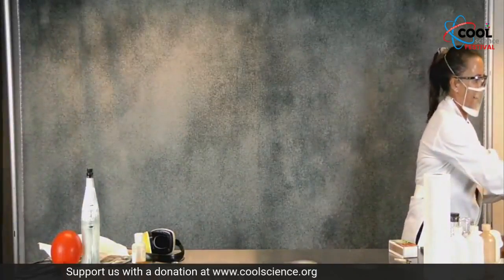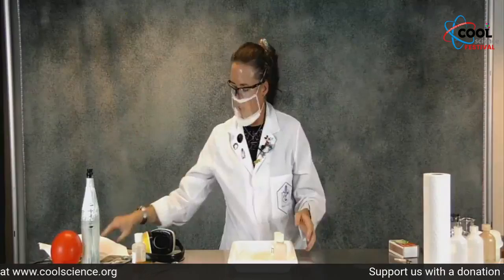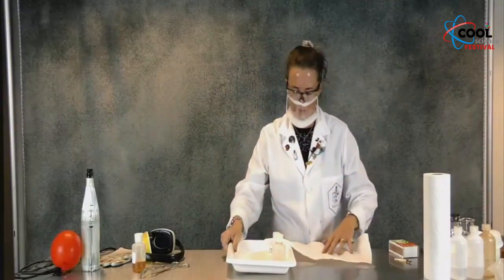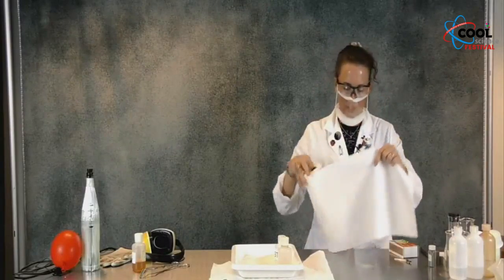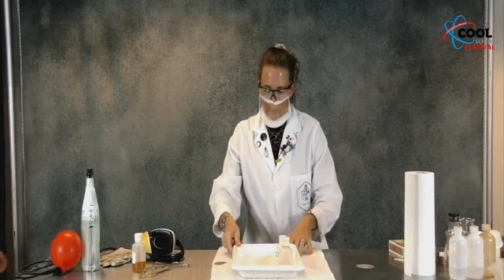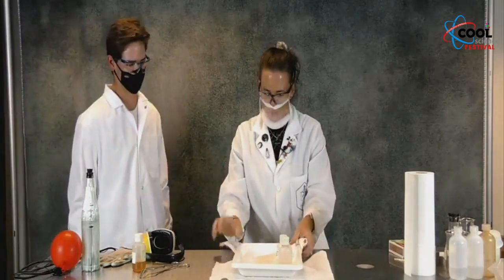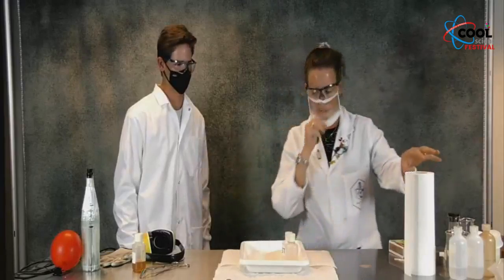All right, our last one is a really cool example of another rocket fuel. This one is the catalytic breakdown of a monopropellant. Come on up, Connor. What we're going to do here is we're going to decompose hydrogen peroxide. This is also known as elephant's toothpaste, even though I don't know why.